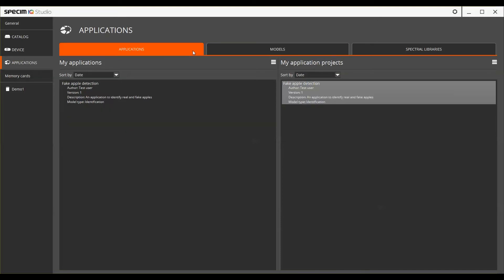Returning to the Applications view, we also have the list of ready applications and application projects. Applications on the My Applications list are ready to be loaded to the Speciem IQ camera.